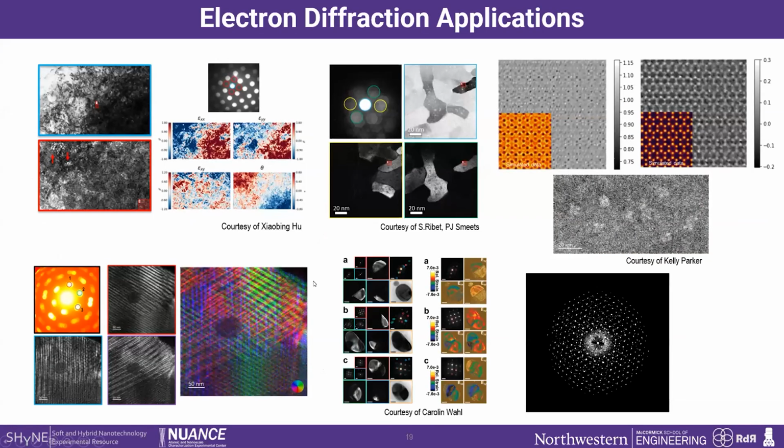Like I mentioned in the beginning, I'm going to leave more to the speakers, but I was putting together this panel yesterday, and they are all great examples of using diffraction, not only diffraction itself, but also scanning diffraction, 4D STEM here. So you have the ability to correlate your diffraction pattern, your reciprocal space, to your real space through these techniques, right? So here you collect different properties from your material.